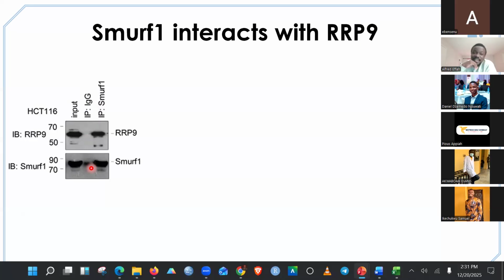It's crazy. Sometimes you troubleshoot and you still see something, but you try your best to make sure that this band shouldn't be there. But we can't just base on this and disqualify the paper from publication. But note that in a negative control, we don't expect to see any band as we are seeing here.